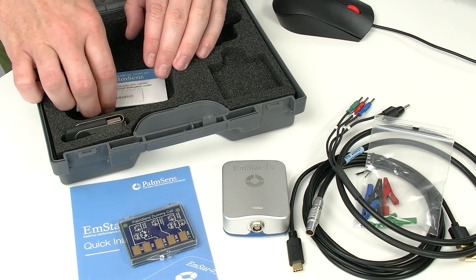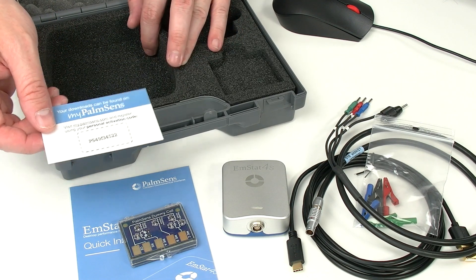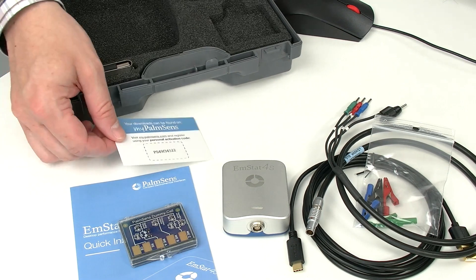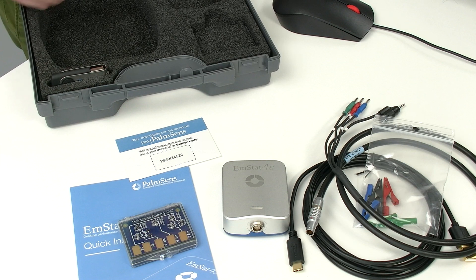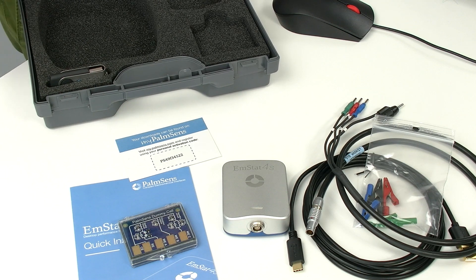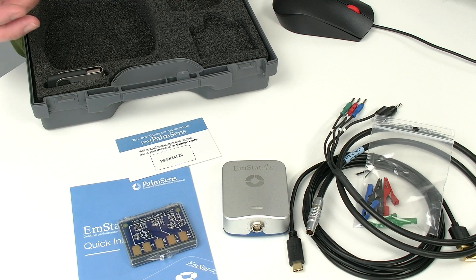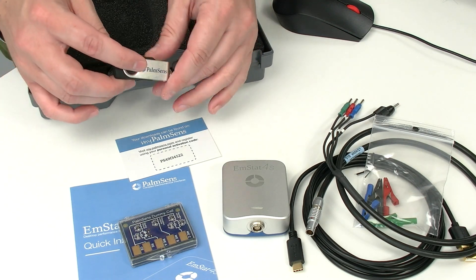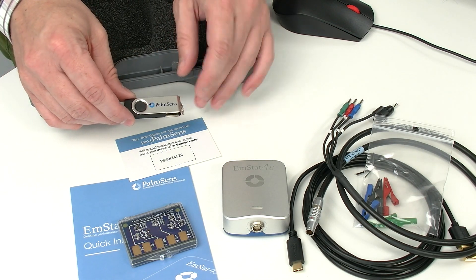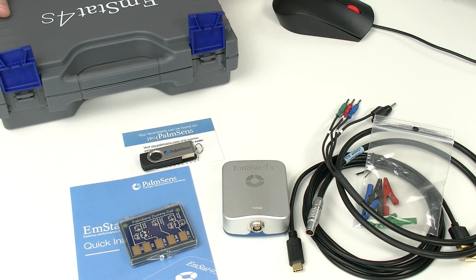Also in the box, you will find an activation code. With this activation code, you can make an account at our website and download the software, PS Trace, wherever you find an opportunity to log into that website. This is very handy if you want to install the software on multiple computers — keep in mind, all future updates are included. You will also find a USB stick inside the box, in case your computer is not connected to the internet.